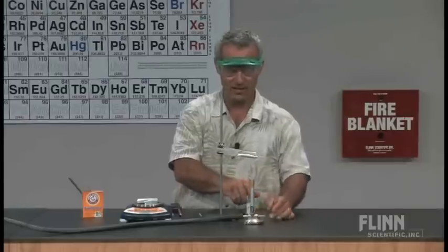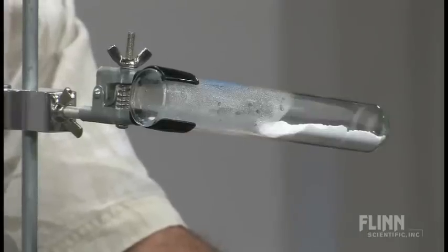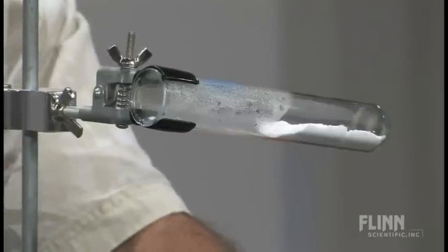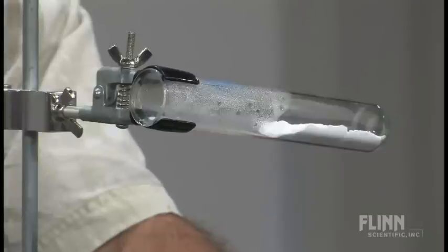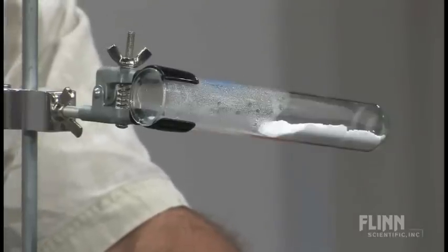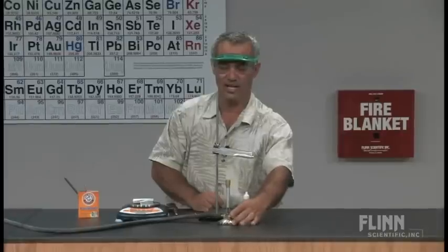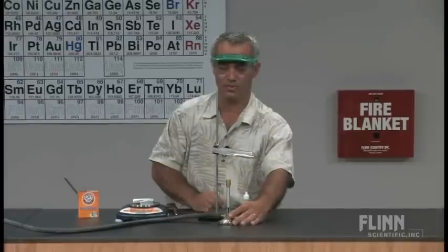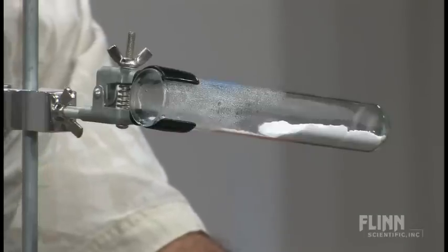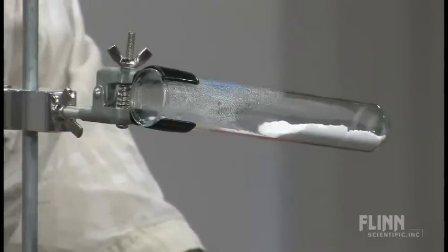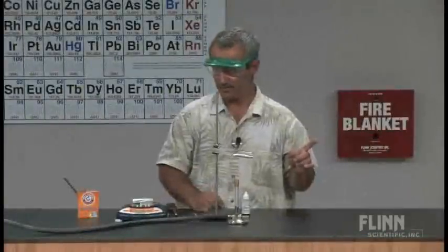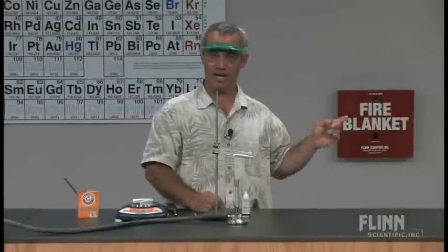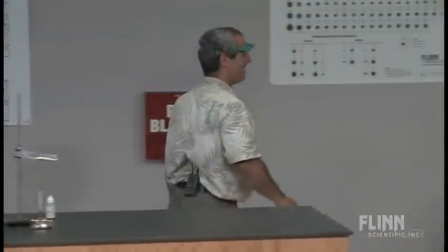They figure out from the lab sheet that that must be carbon dioxide. And they continue to heat this for some time. They're instructed to move the flame up and down the course of the sample there. And they also need to heat it up here to drive off that moisture that was produced. So we're going to let this continue to heat for a while. It takes about five minutes. In the meantime, we're going to see what kind of calculations.